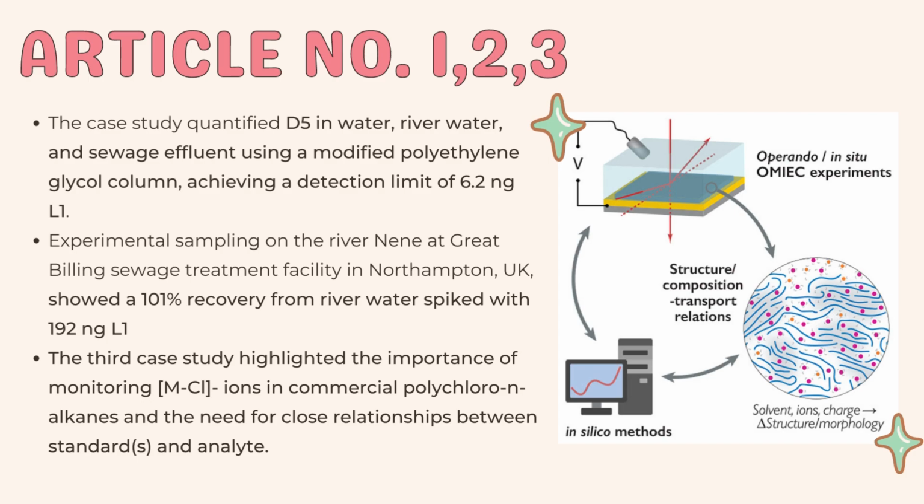I will continue to discuss the data and results for the case study of gas chromatography. The case study quantified D5 in water, river water, and sewage effluent using a modified polyethylene glycol column, reaching a detection limit of 6.2 ng/L. The increased recovery and smaller standard deviation were attributed to sewage influent dilution.